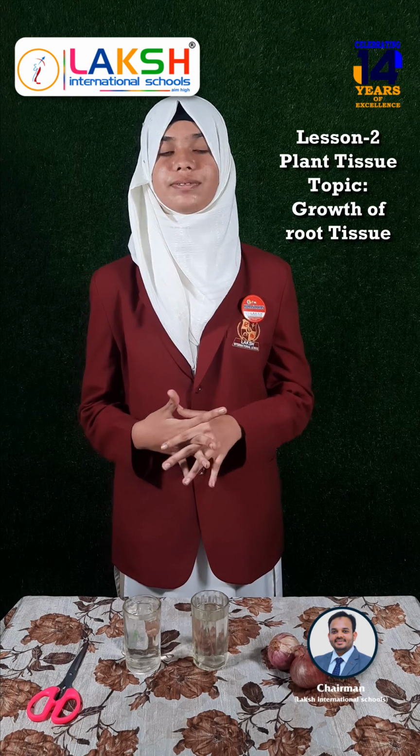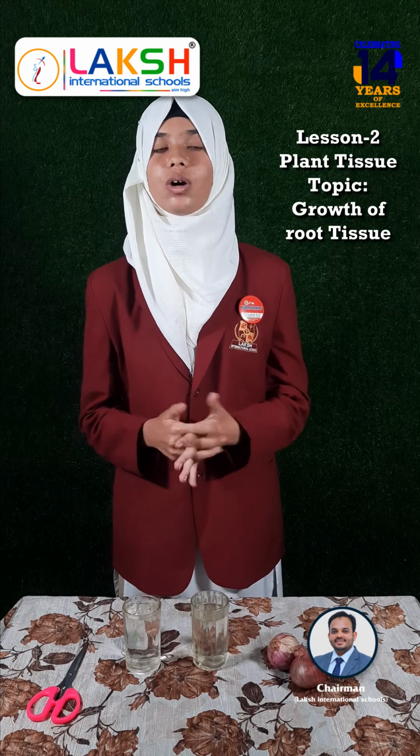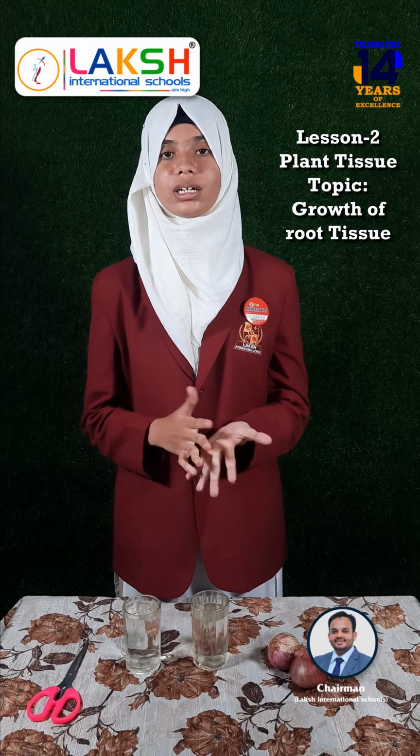Performing my biology activity, the topic is the growth of root tip of onion. Do you know how the plant grows? It is the continuous and active division of cells.